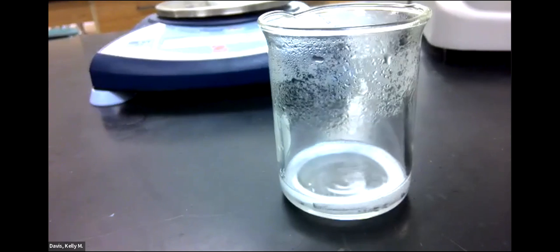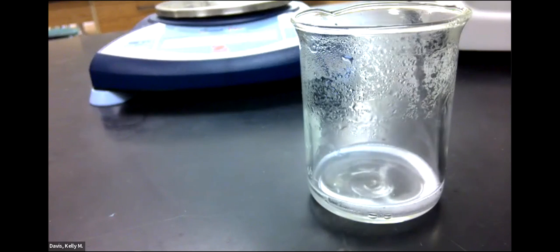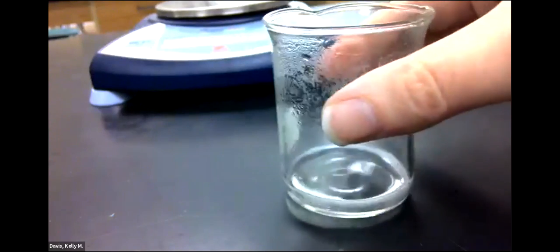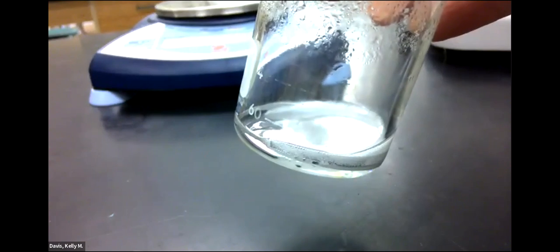I'm gonna let it stop bubbling. Let it finish reacting, make sure all the acid has reacted, and then I'll see if I need any more. Still going. It's very, very hot. Pretty warm. Yeah, it's still bubbling. See it? It's still going. I'm gonna wait till it stops bubbling, and then I'll see if I need any more acid.